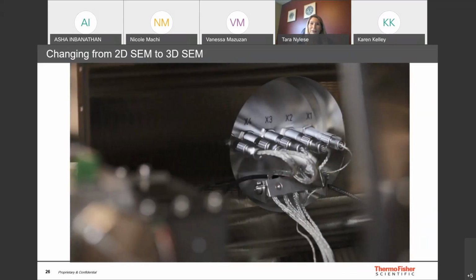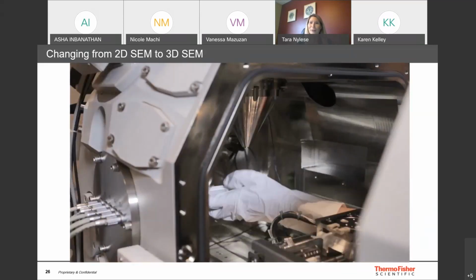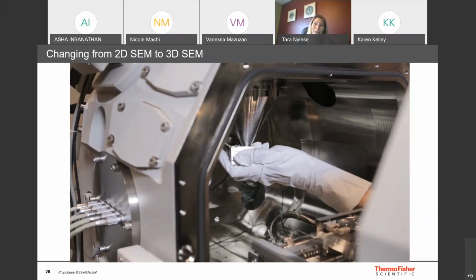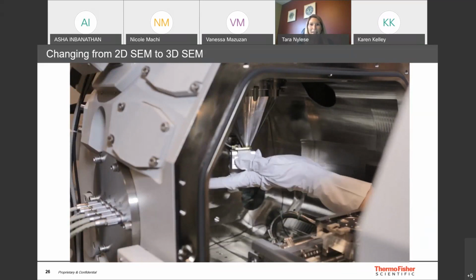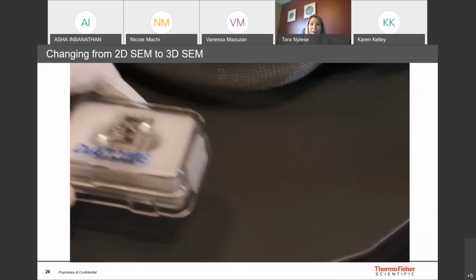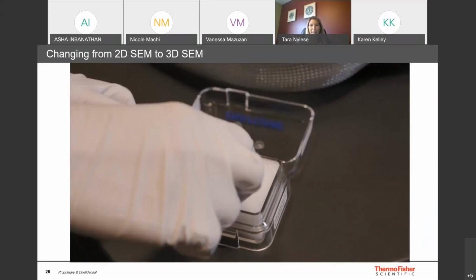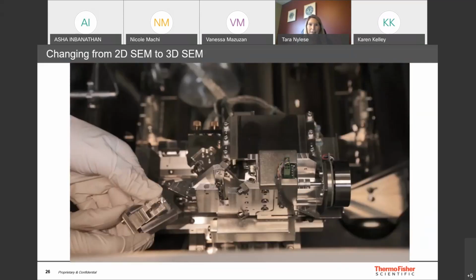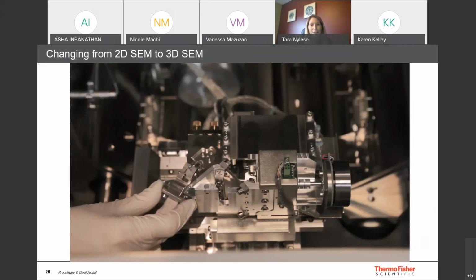So this is where the VolumeScope is well designed so that, for example, you don't use immersion mode when you have your diamond knife in there, or you also don't rotate or get too close to the pole piece, so that you avoid any damage. And then this is the specially designed low vac holder for the VolumeScope, so a little bit different. We have a voltage ring that helps bias the detection so that it prevents or reduces charging.